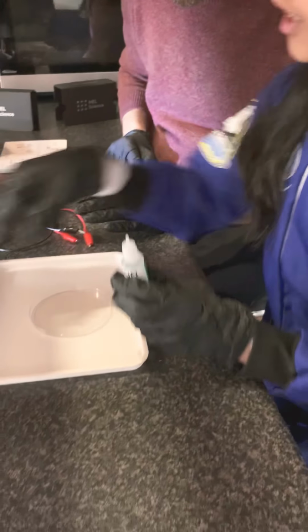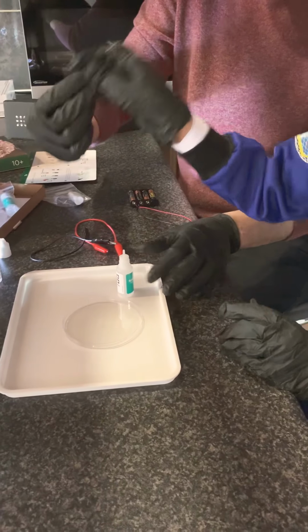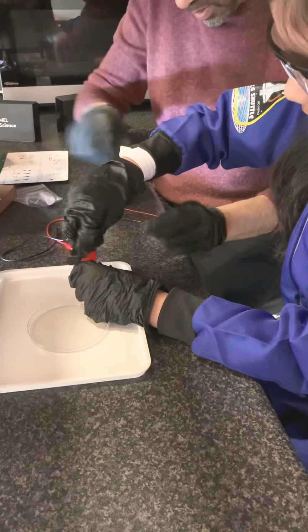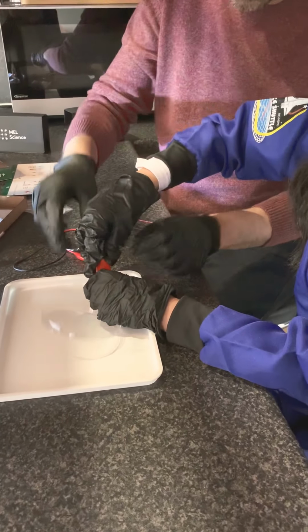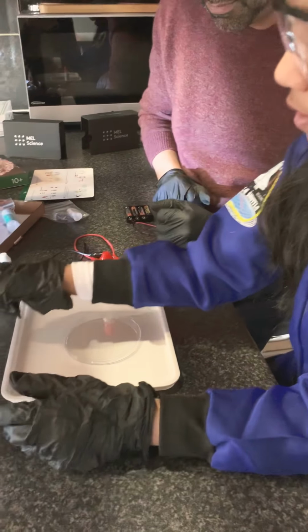Then you need to put the red cap on. As you see, yours should come with two red caps. So you need to put this red cap on top. Make sure you close it properly, because you don't want an explosion. That's enough. It's got a safety feature on it.